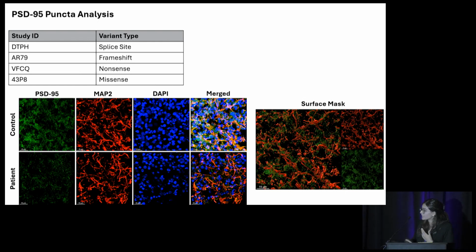So the beginning of this study has been to just grow these organoids, make sure that they have this cortical identity, and wait until they start expressing PSD95 spontaneously, right? So at 3 months of age, we generated cortical organoids from all of these lines and their respective controls, and then what happens is that we collect them.